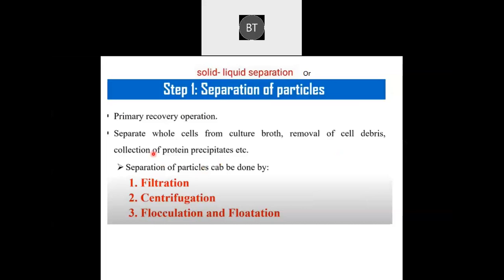Usually here, the first step in the product recovery is the separation of the whole cells. The whole cells means the microorganisms or even the plant or even the animal cells. So to avoid confusion, I will use only microorganisms.